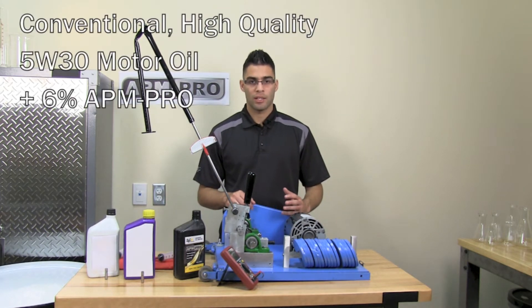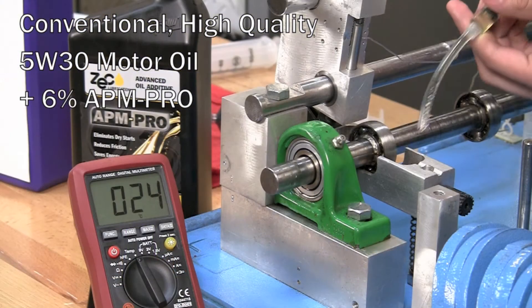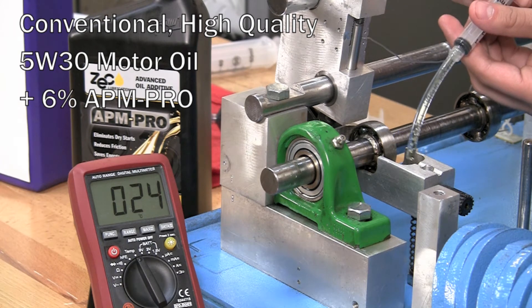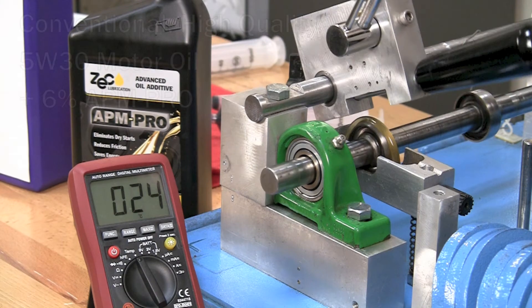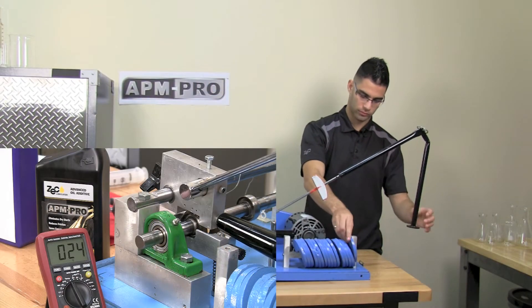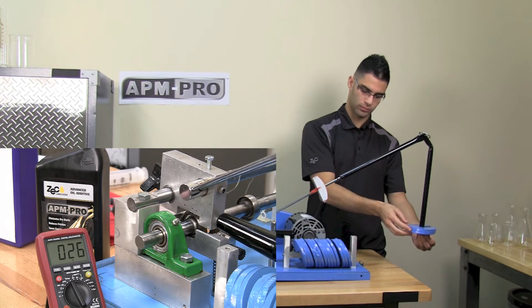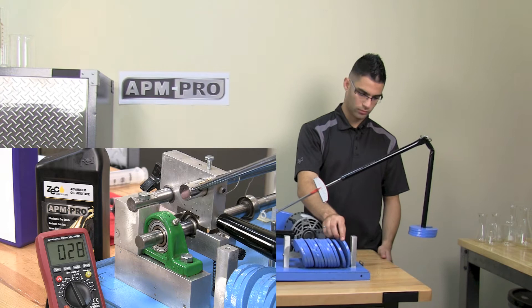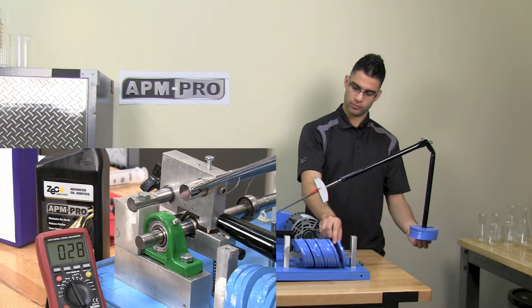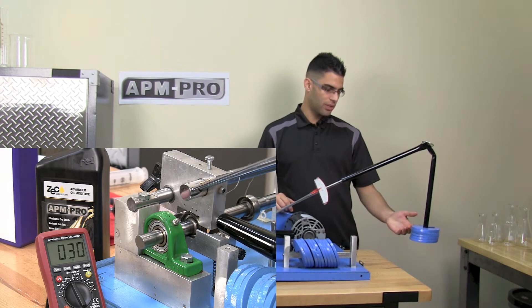We will be using the motor oil and adding 6% by volume of APM Pro to the bath. We will be repeating the same tests as before. As you can see, we have already reached five weights.